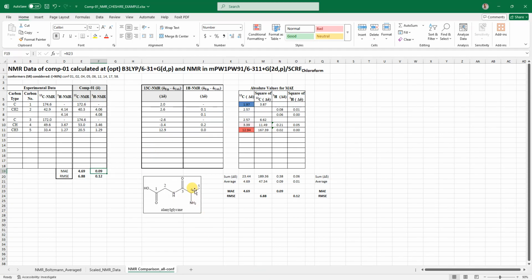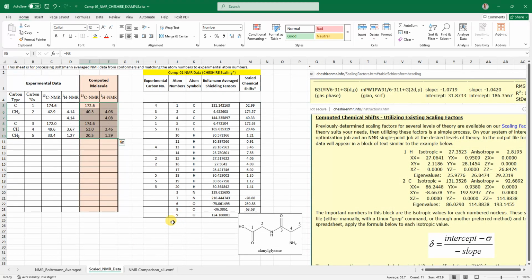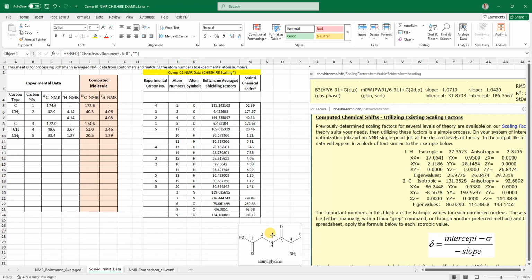So if you had any confusion in the previous video, then yeah, it's better to use this sheet, but still I will keep the other sheet on GitHub so you can use it for larger molecules, or you can expand this sheet according to your needs. You just need a little bit of Excel knowledge, and you can easily adjust this sheet according to your needs. I hope this will help if there was any confusion in the previous video, and this will help you to put all your data in the sheet and get really nice results and do the NMR conformational sampling.